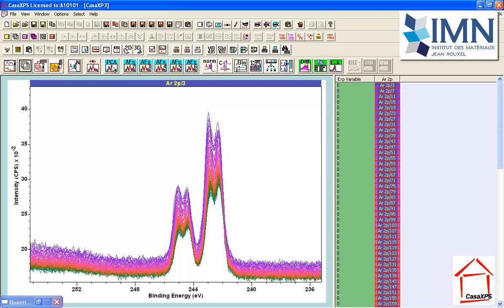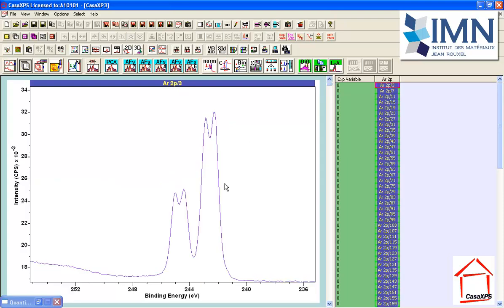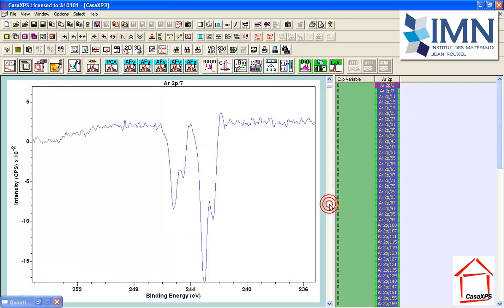So let me do the decomposition. Press the PCA button on this toolbar and we do indeed see spectra. The first one looks very much like the spectra. It's actually very close to the average spectrum in its variations. The second one, now this is interesting because it's showing us that there are shapes. They are not physically meaningful shapes, but they show that there are deviations from that average spectrum that we need to investigate.